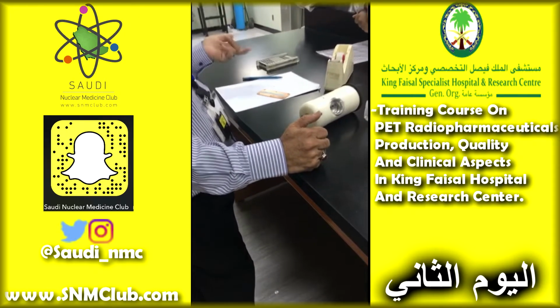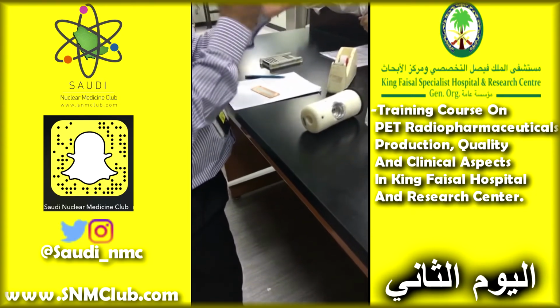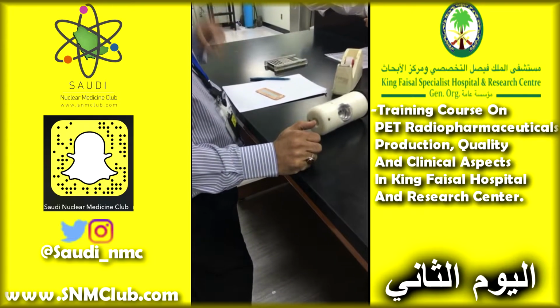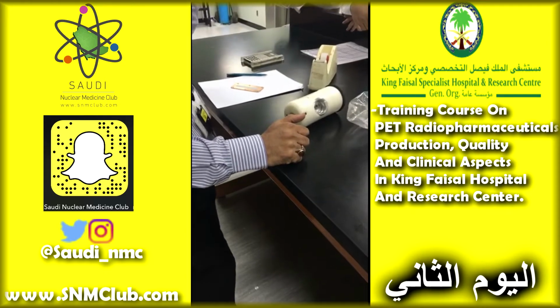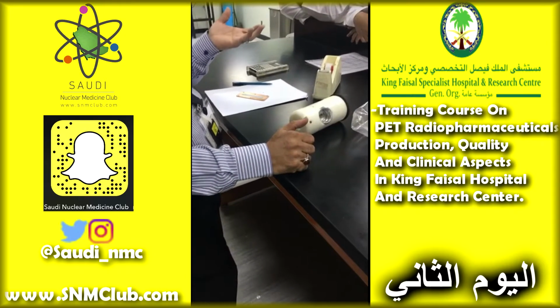Simple chemistry. They precipitate with a different chemistry and isolate it, maybe as an oxide or something, and you're going to plate it again, use it for plating, recycling. Okay, next. You purify it, and after that you have a concentrated bulk of the isotope.